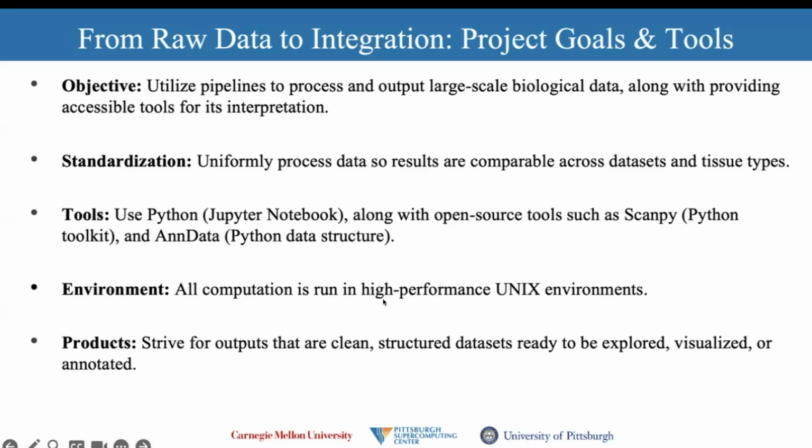Once we got a readable file, I used Python, particularly Jupyter Notebook, along with some open source tools such as ScanPy and AnnData. All the computation was run in high performance Unix environments, and I was striving for outputs that were really clean, structured data sets that were ready to be explored, visualized, or annotated.